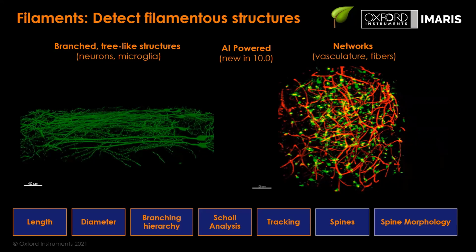So this is definitely dependent on your resolution, and if you're able to image that deep, maybe you have a cleared image or something, then that's not a problem. But depending on what you're trying to do, and how deep you want to image, you can do this, yes.